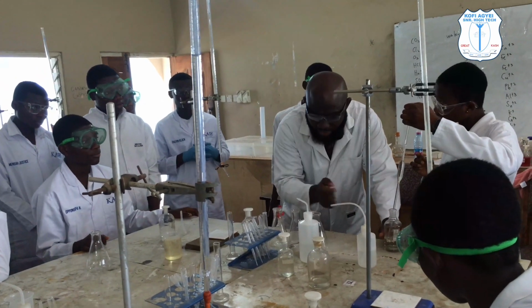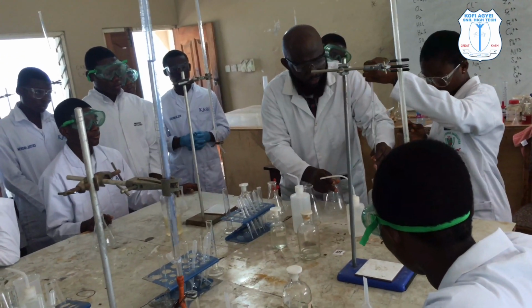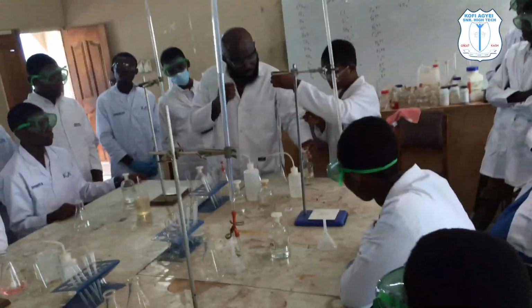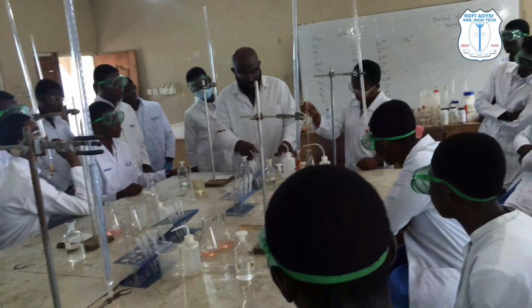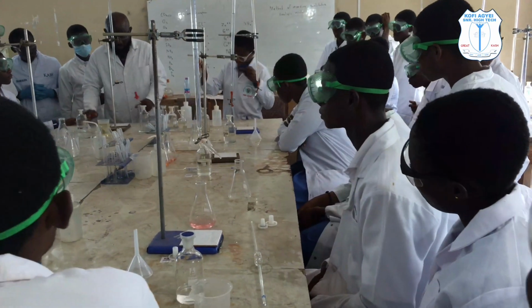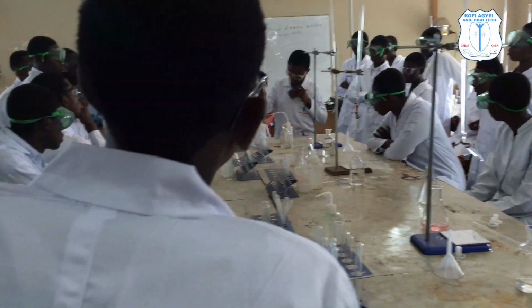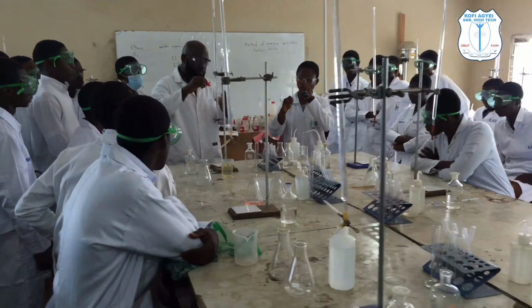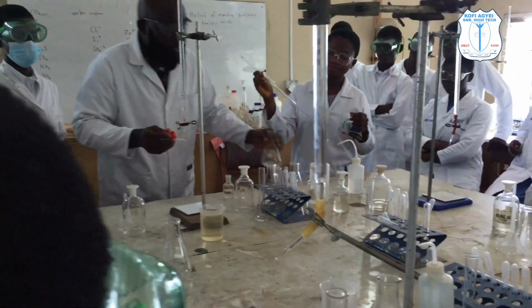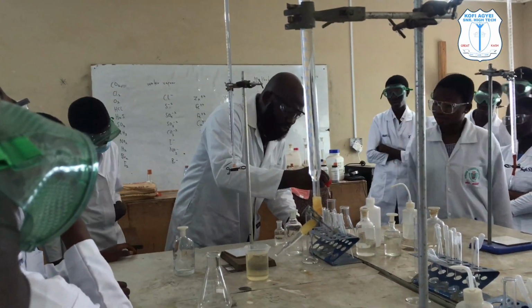Now when you are adjusting, take your time. Now hold it firm, hold it firm. Then relieve the pressure. Now when you adjust, you have to hold it firm with the thumb. So this one is the base. We've pipetted the base. Now this one is the phenolphthalein. So how many drops? 3 drops.